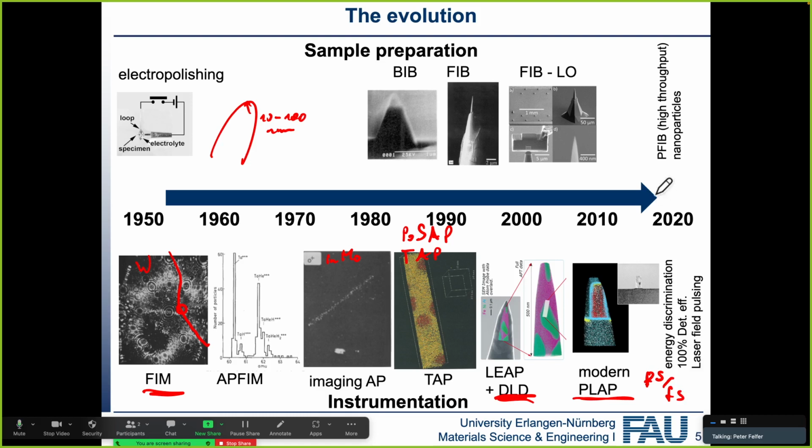Most of the modern setups that you see are from 2010 onwards, which are really good commercial laser setups with a wide field of view, and now we're seeing continuous development on this for even higher fields of view, more modern lasers, and so on. So this was one aspect.